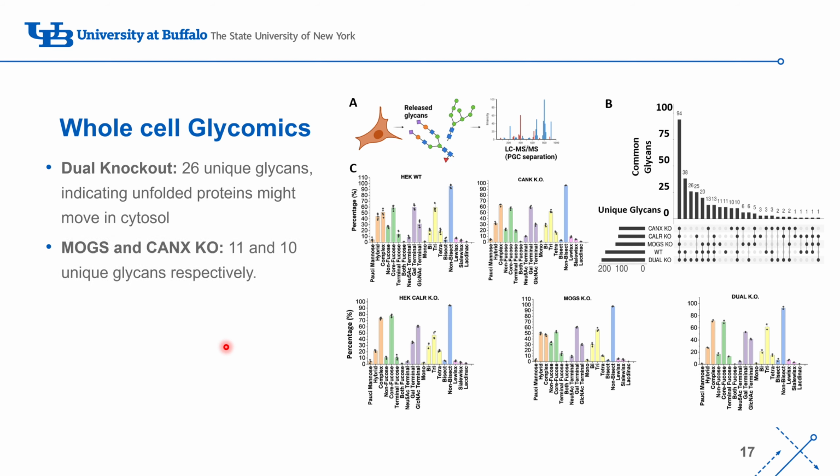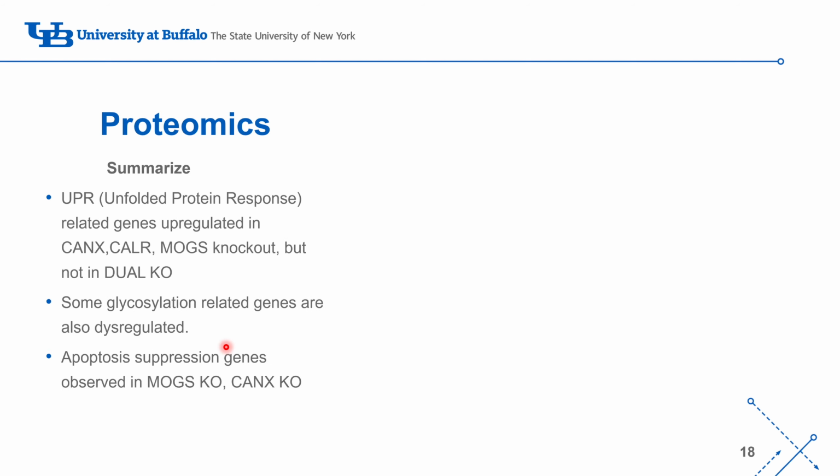So this is what we have just now discussed. And the last thing that we have done is this apoptosis assay.